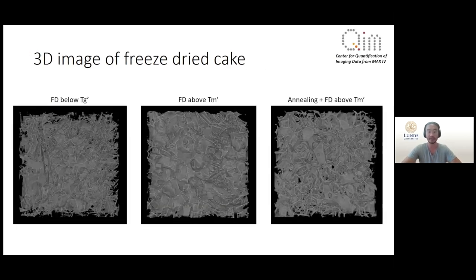So after obtaining this 3D image of the freeze-dried cake we need to analyze the structure. Here we have three different freeze-dried structures from three different freeze-drying protocols. In short, the first structure on the left is freeze-dried at low temperature, the middle one is done at a little bit higher temperature, and the one to the right has undergone an annealing process. I should also emphasize that it's important to do proper preparatory work to remove noise and interference and to set the proper threshold to ensure that all the materials are included.